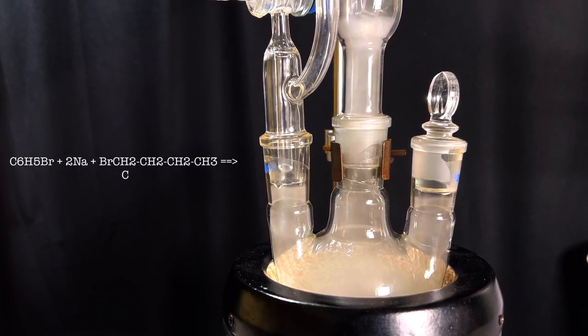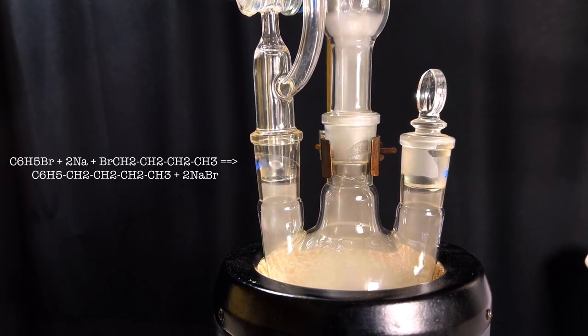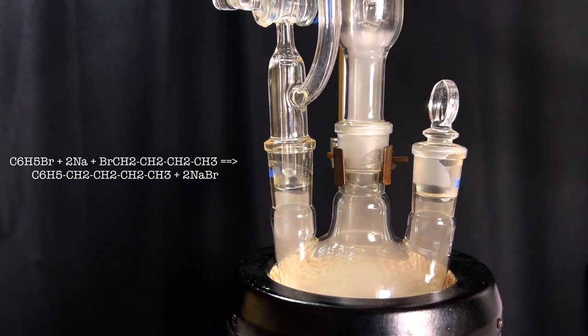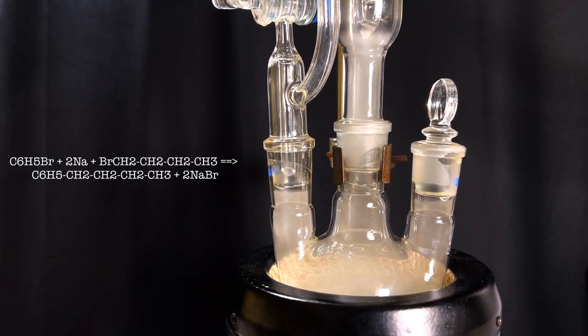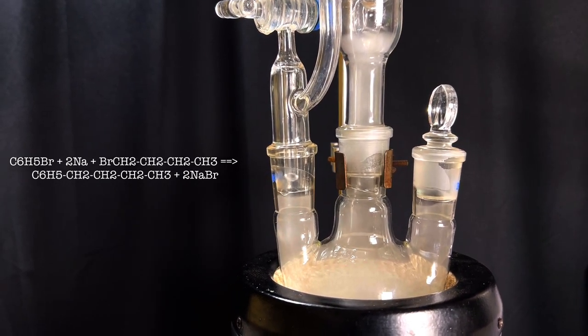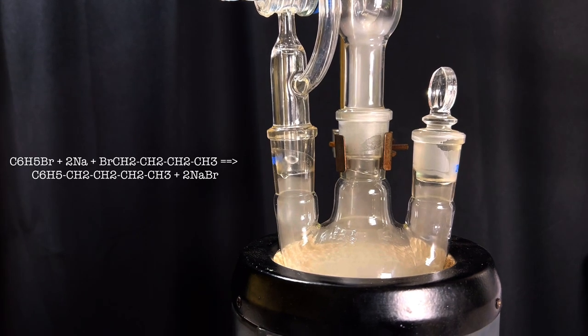The overall reaction that is happening here is like this: The bromide from the bromobenzene and bromobutane joins with two molecules of sodium to form sodium bromide and this gives rise to the condensed hydrocarbon butyl benzene. The byproducts formed like n-octane and biphenyl can be easily separated by distillation.